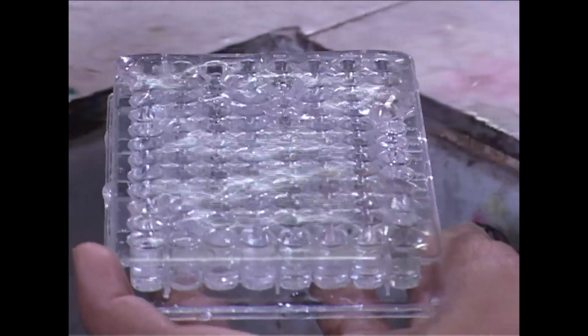And after washing and incubation, we will add the substrate, and just by seeing the color change and intensity of the color, we can find out whether the specific primary antibody is present in the sample or not. If it is present, then from the color intensity we can find out its amount. Since two antibodies are used here and the presence of the primary antibody is detected by using a second antibody, this process is called an indirect ELISA.